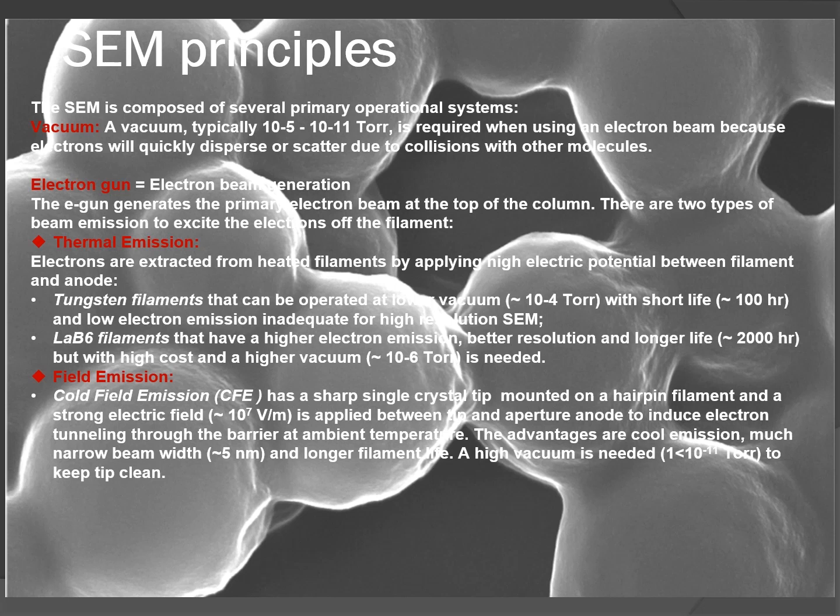Schottky emission is a secondary type with a similar setup to cold field emission, with a tip coated with zirconium and heated to facilitate electron emission and tip cleaning. Schottky emission has higher source stability, low beam noise, and high electron yield compared to cold field emission.